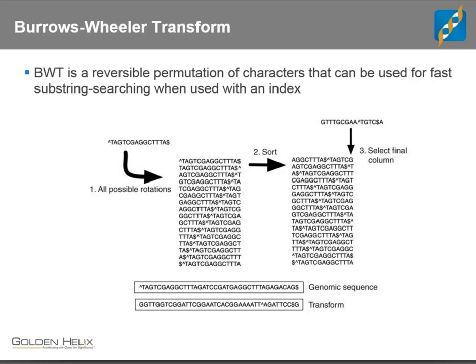Okay, so it happens that this algorithm is also a really great way to build an index into a very large string. So we're going to touch on a little bit of how it works, and we'll get to the climax of how it's used in alignment algorithms in a bit. How it works, and this is again really fun for me to get into as a computer scientist, but I think you will find that understanding this gives an insight into what an alignment algorithm is capable of doing and not doing.